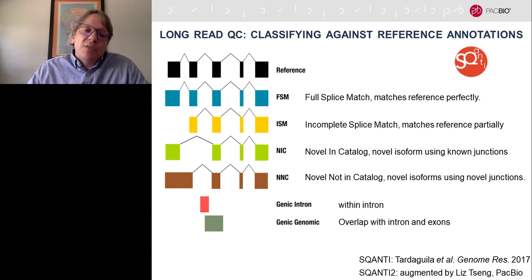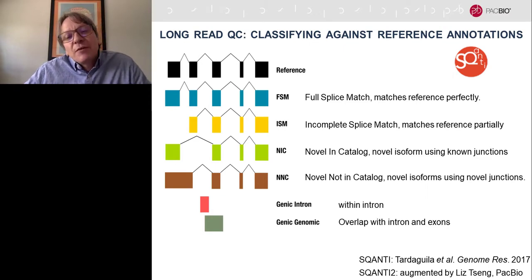see, okay, we know these things make full-length transcripts, probably because of the template switch oligo technique, but are these actually looking like full-length transcripts? So in the effort to sort of walk before we run, we wanted to do a relatively easy experiment and then look at what those reads look like. And so we then took the long reads and classified them against reference annotations. And so I'll just cover that quickly using the SQANTI tool that was developed by Ana Conesa's lab.